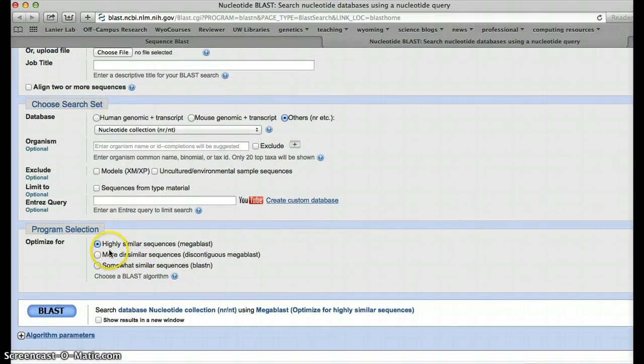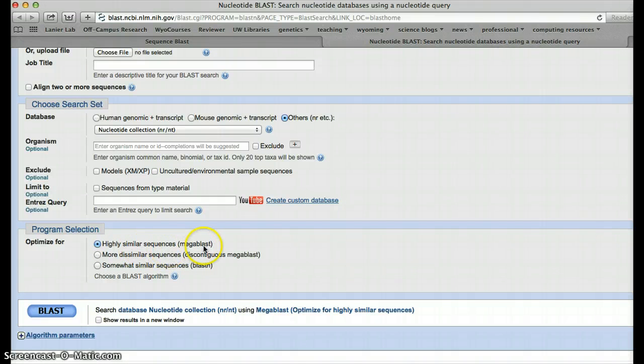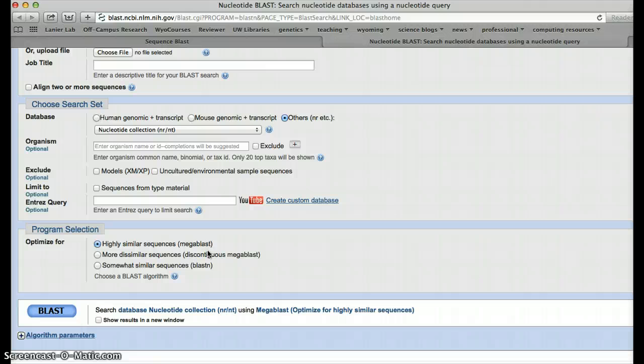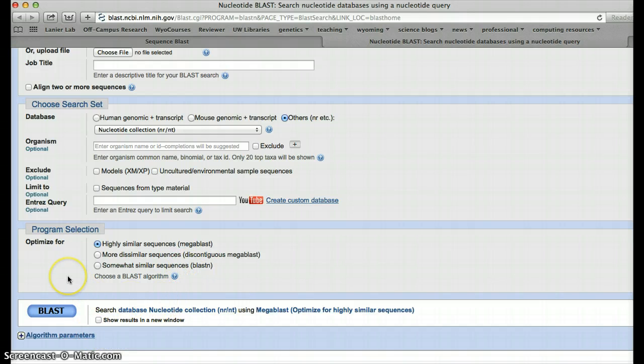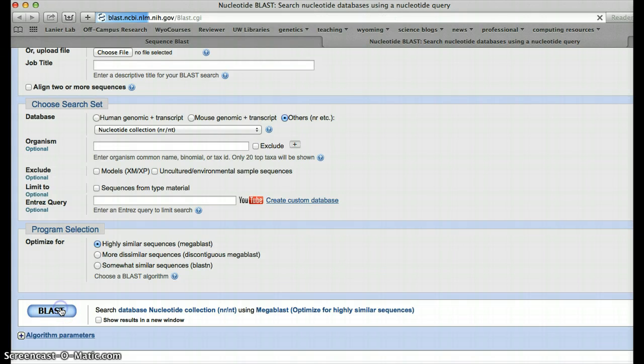We're going to go down here, and we're going to look for highly similar sequences, which is called a megablast. If we were working with something that was really poorly known, if we were working with some sort of environmental data, we may want something that's more dissimilar or even just somewhat similar. But in this case, given the data that you've been using or that you've got access to, highly similar is a much better choice, partly because it's a lot faster.